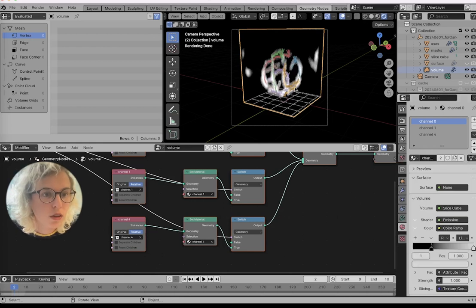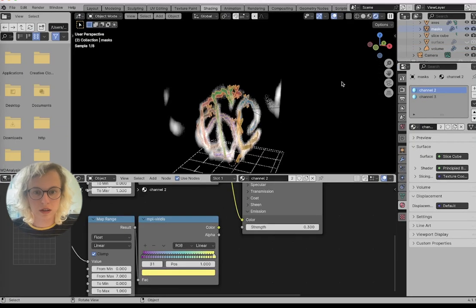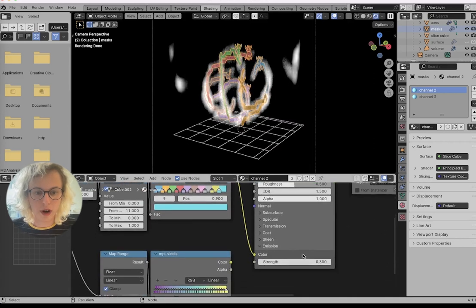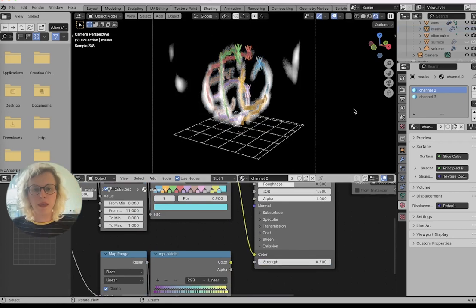And we can see our spots. We can even make our spots slightly brighter so that they really show up clearly. And they have the same color as the synaptonemal complexes they belong to. So this is, I think, quite nice.